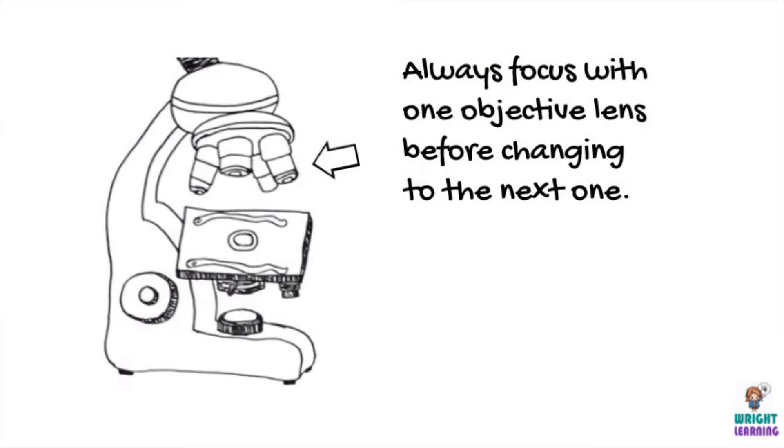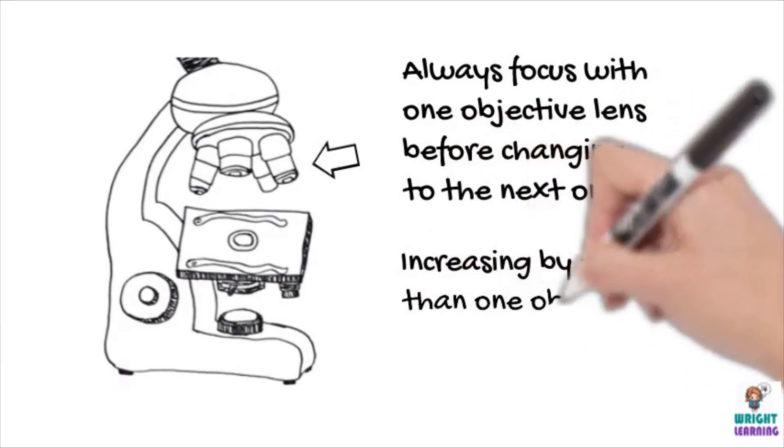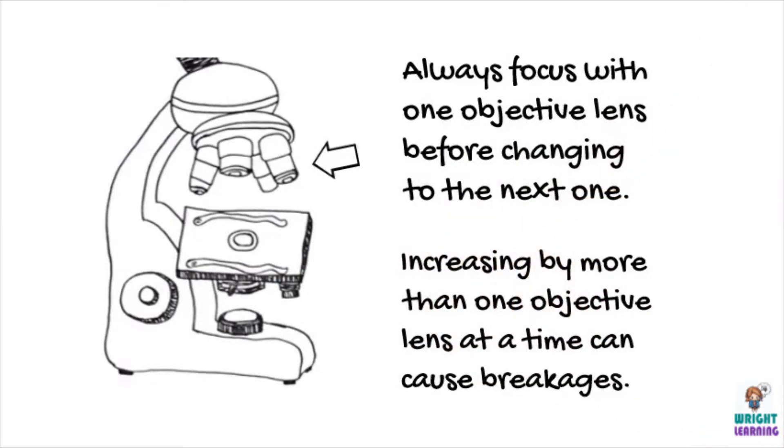Notice how the length of the objective lenses increases as they increase magnification? Increasing to a more powerful objective lens before focusing with the one before it properly can actually lead to breaking the slide or one of the objective lenses.